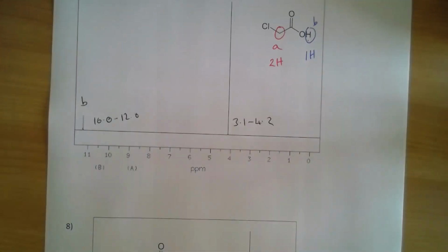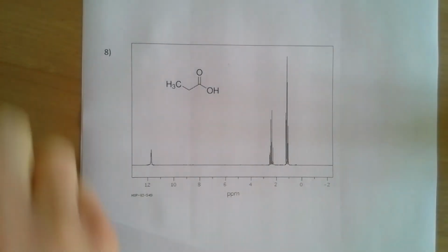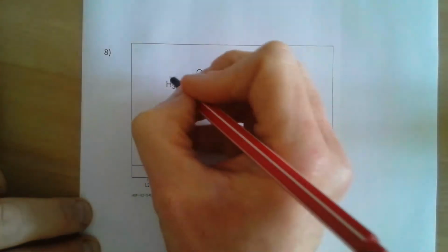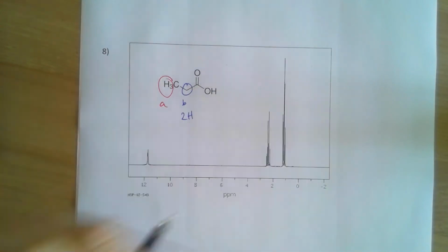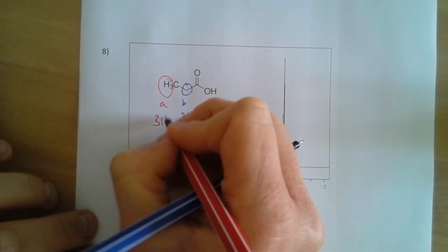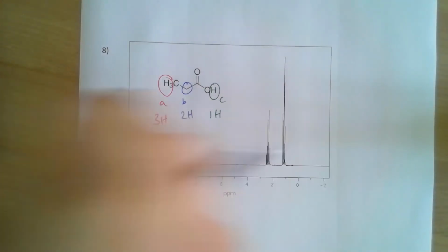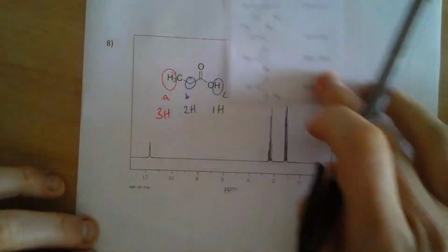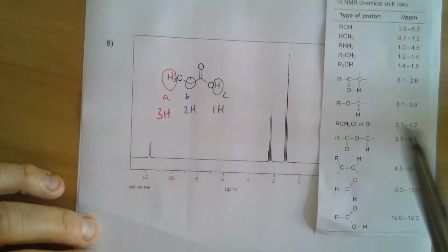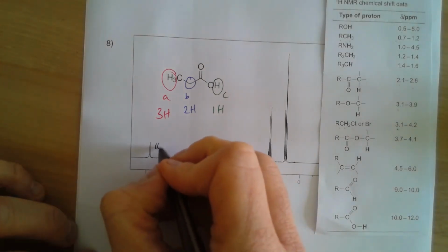And the 8th and final example. So let's label the hydrogen environment. Environment A, environment B, which is a 2 hydrogen environment, and just remember that is also a 3 hydrogen environment, and then environment C, which is a 1 hydrogen environment. Let's start with environment C. It's probably the more likely easier one for us to assign. It's the acidic hydrogen again on the carboxylic acid within the range 10.0 and 12.0, exactly where we expect to see it.